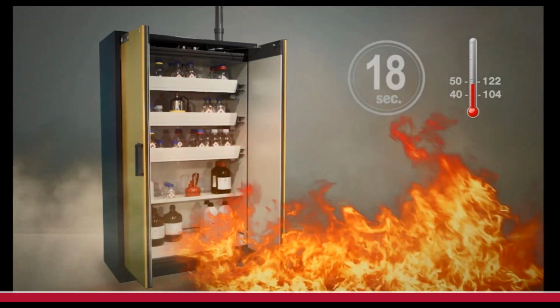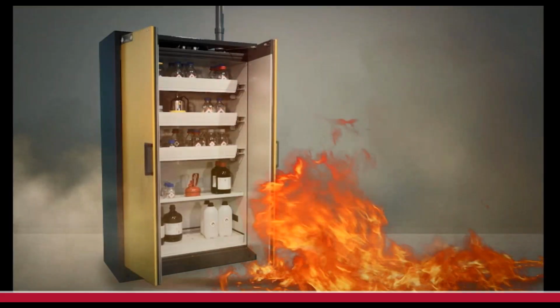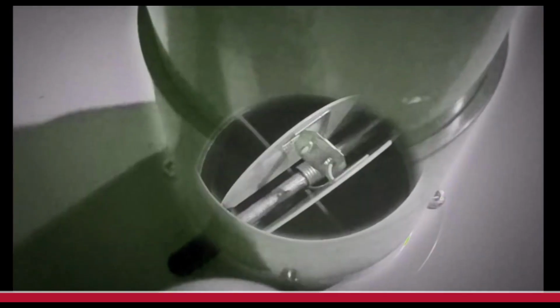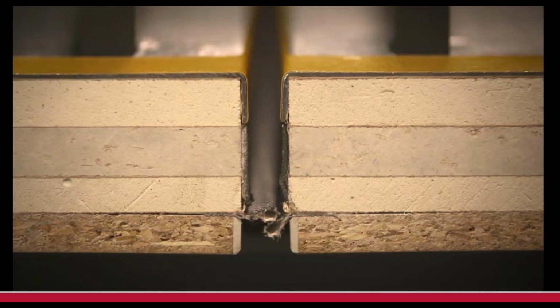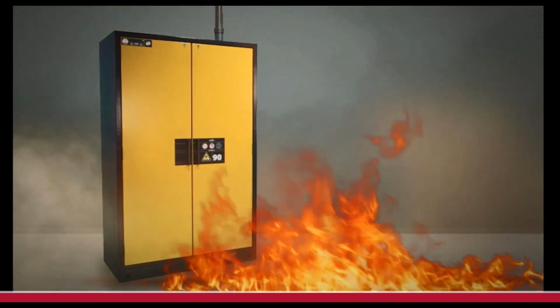But if you leave drawers and doors open, of course you've got to use a fusible link or some means to close those things, because that's extremely important. You've got to get the door closed to keep everything safe on the inside. When you're ventilating, because we've talked over and over about ventilating, I know everybody who leaves here is going to ventilate their cabinets going forward, or their rooms, or whatever it is, you've got to seal up around all the perimeters. So not a 3-point latch, because that just holds things closed, we hope. But sealing up the gaps is the way to do things.